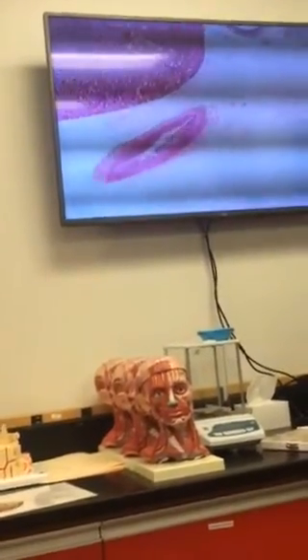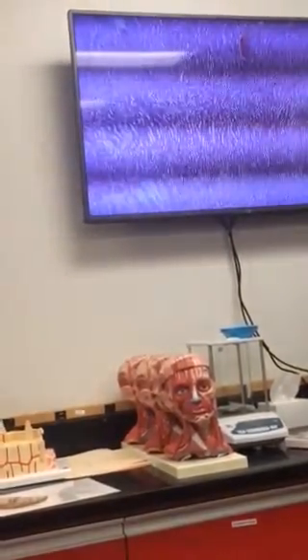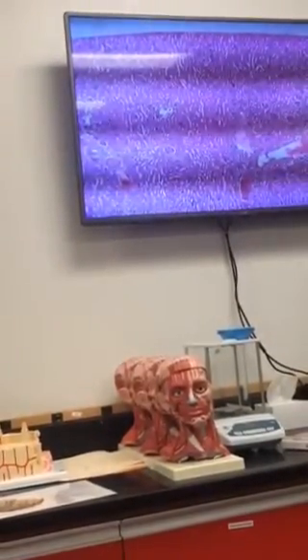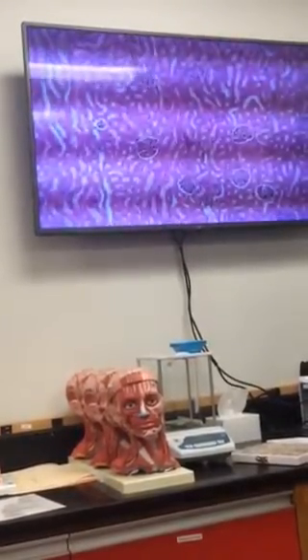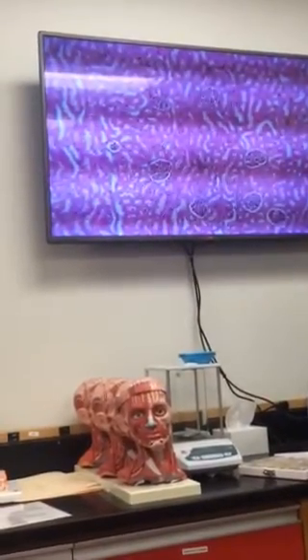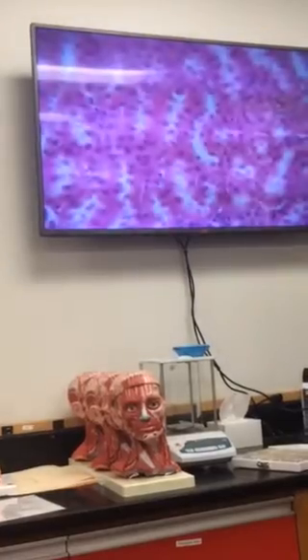Well, one of the better kidney slides that I've seen, actually. Because you can see the entire medullary layer in the papilla, and then as you go up into the cortex, this would be the outer layer, you can see the glomeruli. Now, if you go up in power a little bit, and you can begin to see the convoluted tubules, both distal and proximal, that encase them or surround them. And then, let me go up one more to this high power.